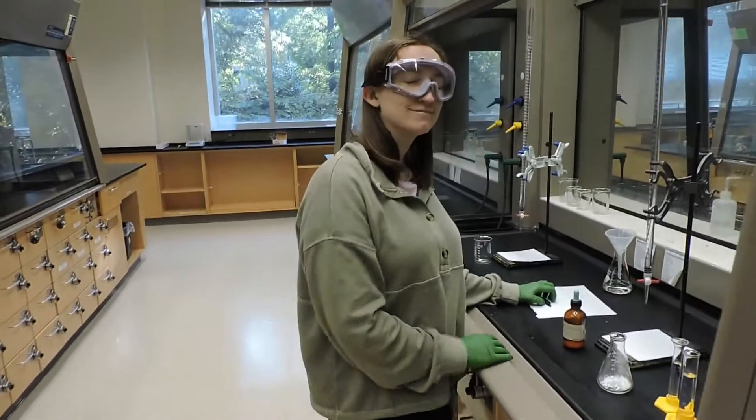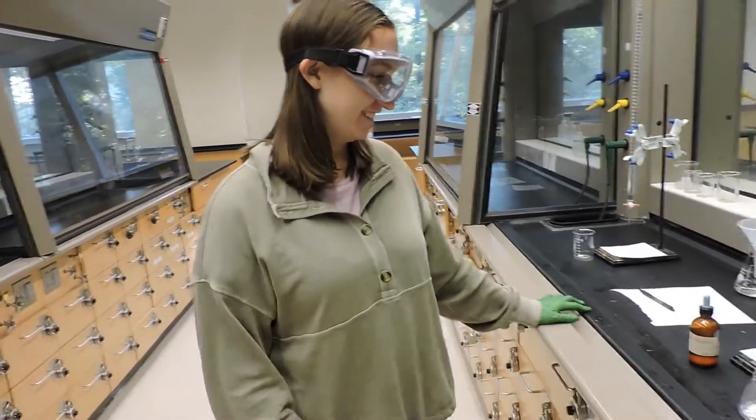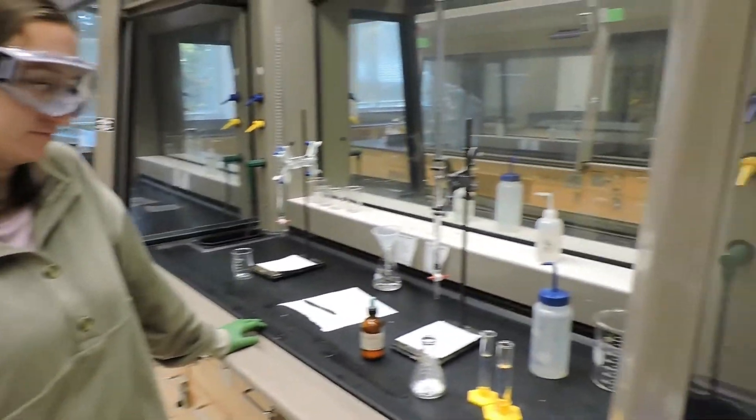Today we have Amy performing our experiment. We're going to do the synthesized aspirin titration.